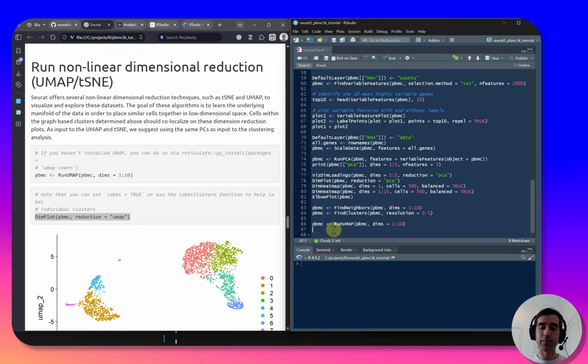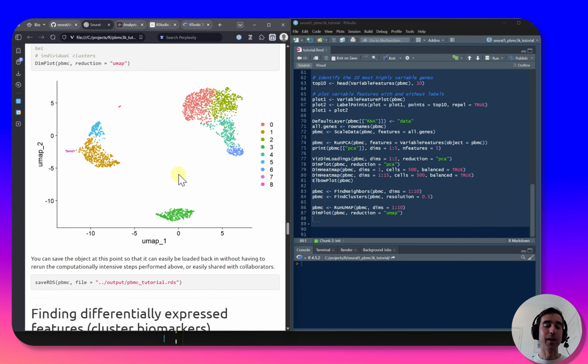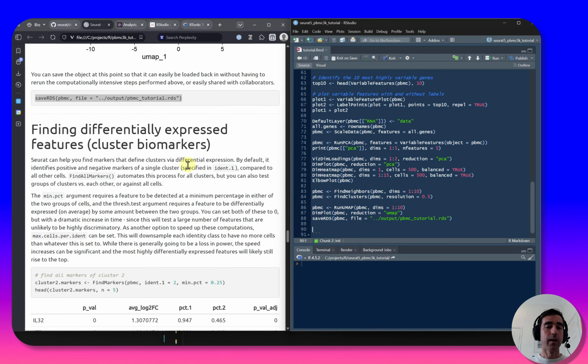All right, so I'm sure we've lost a lot of richness from this process. I mean, nothing comes for free, but we get something like this, and that looks like something interesting that we might care about. So there are options here to save the data as well. And we're going to add that and then check if it actually got saved.